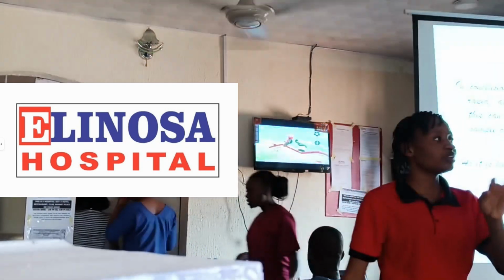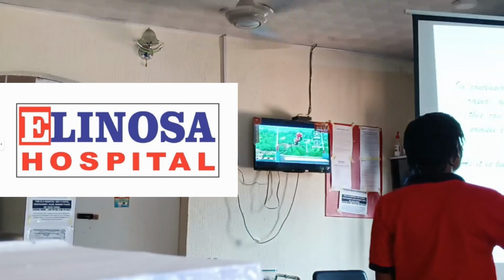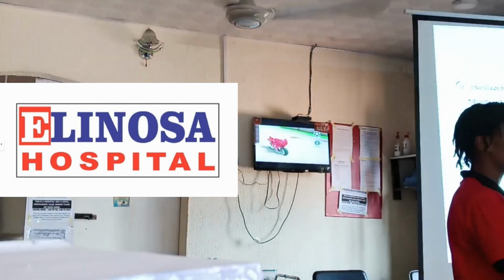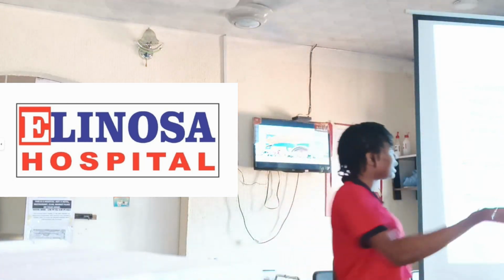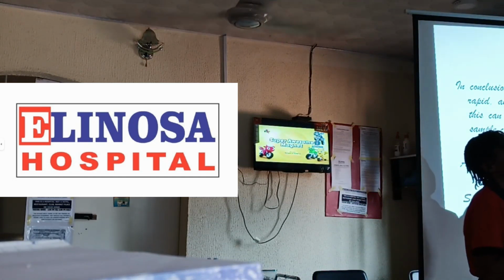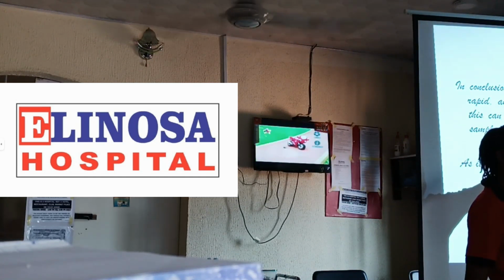Reliable, rapid, and relevant results. Reliable in the sense that if I run PCV here in this laboratory for a patient or for myself and I get 36% as a PCV, if I take that same sample to another laboratory, they should also get the same result, plus or minus 1. So that is one of the laboratory's goals, to produce reliable results.